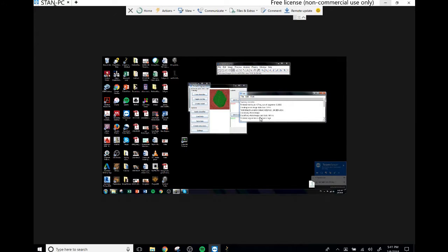Yeah, that's how it's done. You just show the red, that's what you don't want, and green is what you do. And you can fiddle around with this to try and make things suit your fancy. So I can see right up here there's a little bit of green that's being selected. There's some green up here that might be not what we want, but it's okay. We'll move on from there.